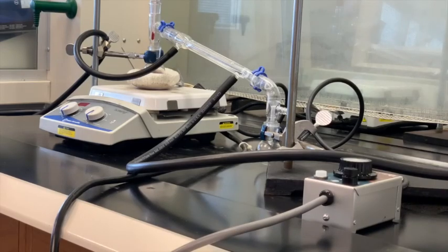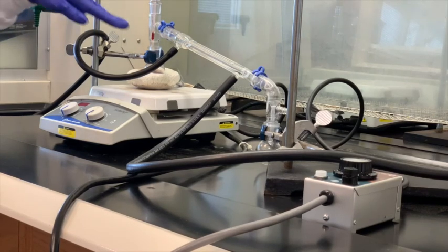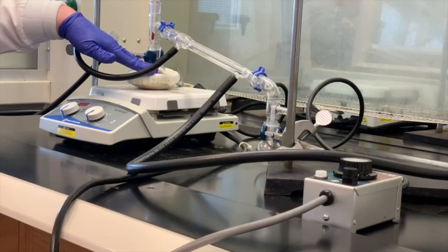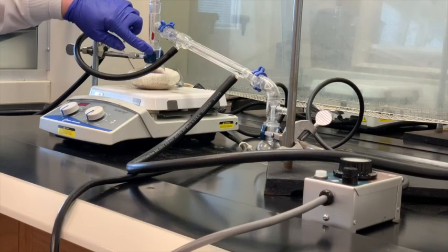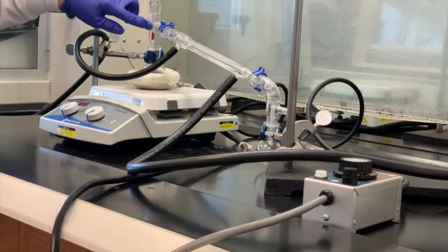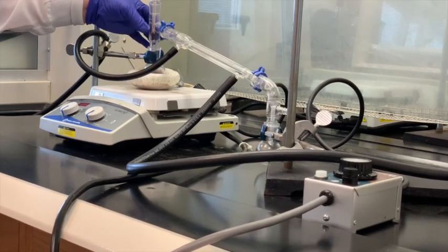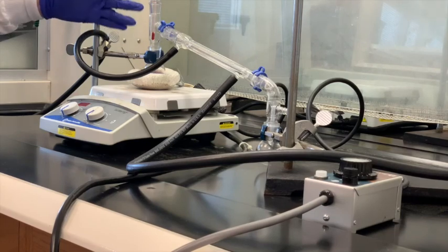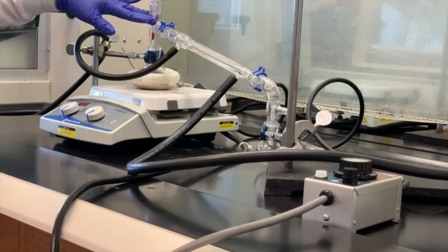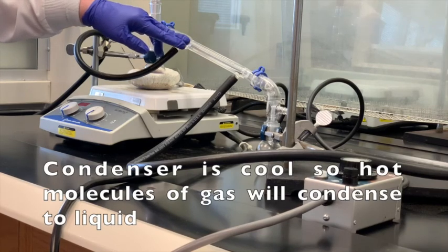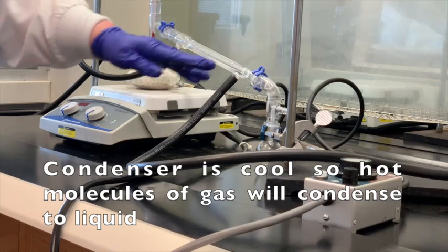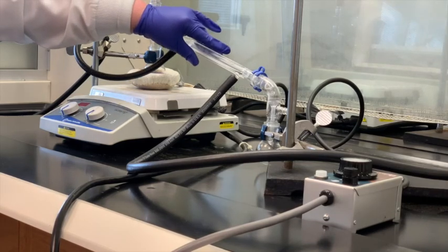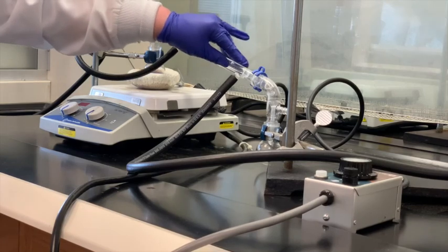In terms of distillation, what happens is that when we start heating this, the substance, the component that has the lower boiling point, will start going into the gas phase. And those gaseous molecules of the methylene chloride will climb up through the adapter here. And when it gets into the side arm, it will start moving down the side arm. We can ask the question, where do gases go? Anywhere they want to. So once those vapor molecules move upward, they'll find that side arm, and then they start traveling down the condenser. And remember, the condenser is cold, we've got a continuous supply of cold water coming in and going out. So once those gaseous molecules hit this cold condenser, they'll condense back into the liquid. And that's what we're going to be collecting in our receiving flask.